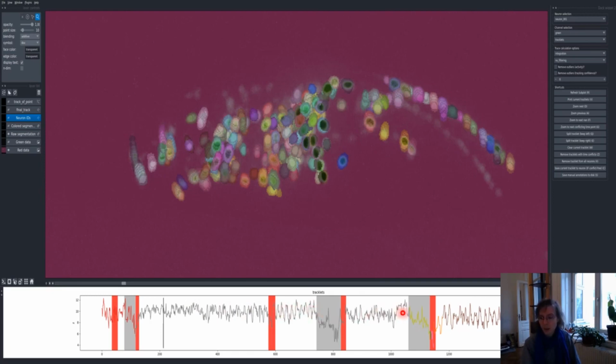are stitched together. For the most part, very long, although some behaviors cause difficulties in the tracking. In particular, the reversals in gray can cause some differences in position. We can see a systematic difference in Z, for example. But the turns in particular cause massive deformations and huge difficulties with tracking. And so many tracklets are destroyed at that point in time.